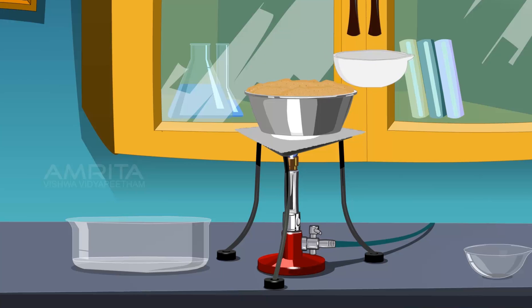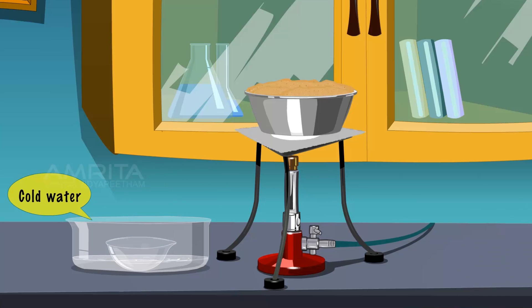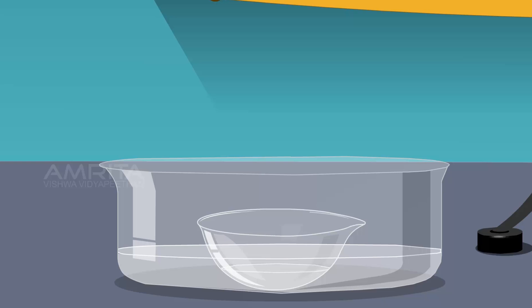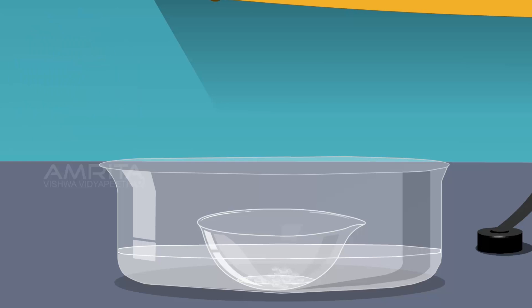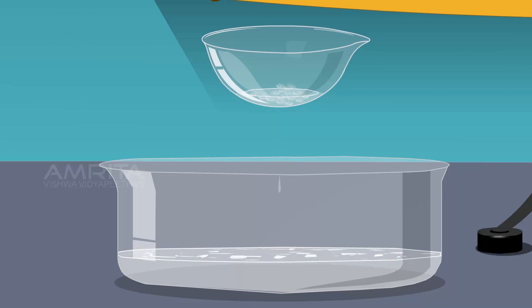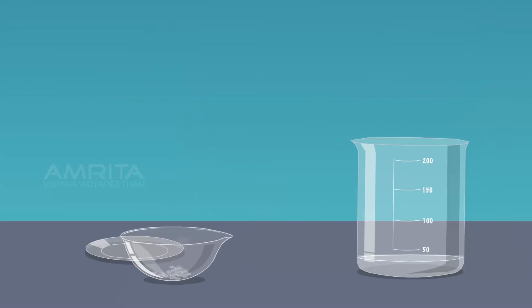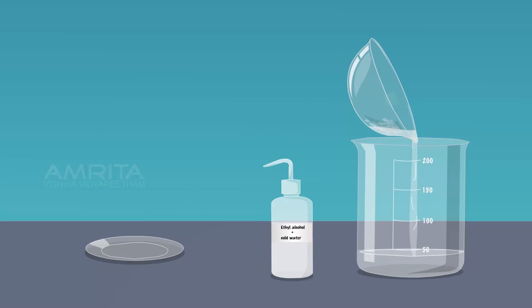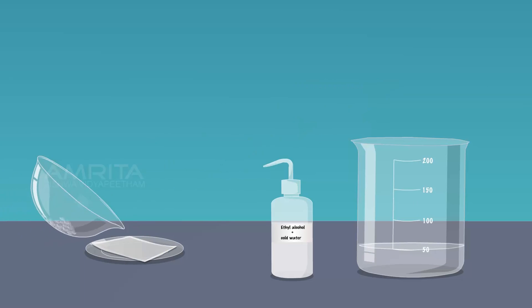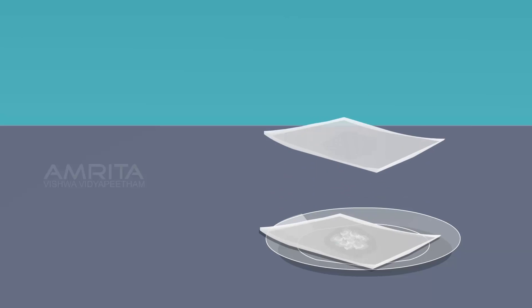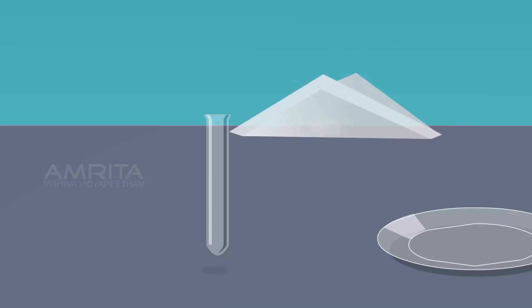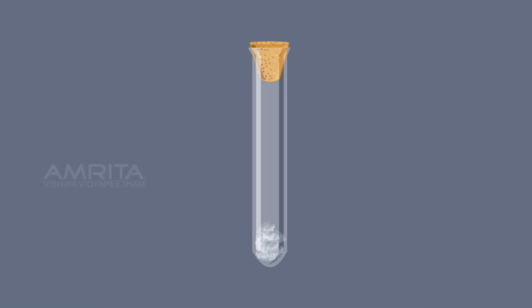Now turn off the burner and stop heating, and transfer the hot solution into the crystallizing dish. Place the crystallizing dish containing hot saturated solution on the trough half filled with water. Allow it to cool slowly for some time. Colorless transparent crystals of potash alum will separate out. After about half an hour, the crystallization is complete. Decant off the mother liquor carefully to the beaker. Wash the crystals with little ethyl alcohol containing a small amount of cold water. Remove the crystals on a filter paper which soaks the solution. Transfer the crystals to another filter paper and dry them by pressing gently with another filter paper. Transfer the crystals into the dry test tube and cork it. The crystals of potash alum are colourless, transparent and octahedral.